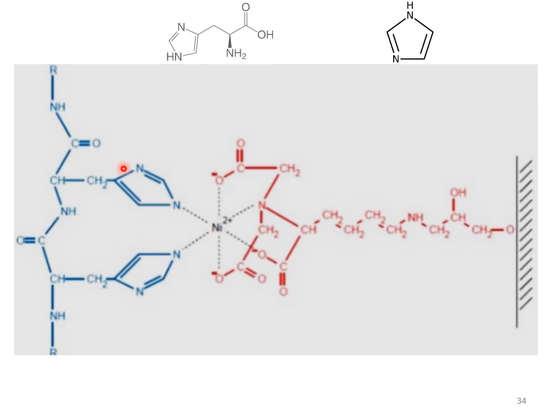So histidine tagged proteins will have a specific binding affinity to the nickel ions on the stationary phase, and they are bound here. Other proteins will not bind to the column and they will be removed. And later, when we add imidazole, it is going to displace the protein and itself will become associated with the stationary phase.